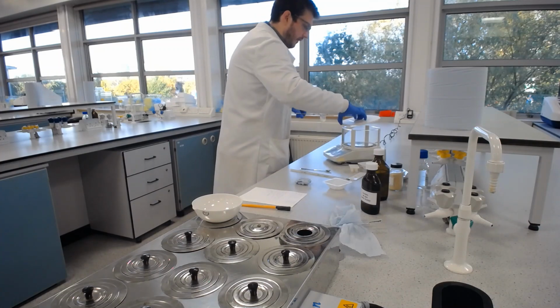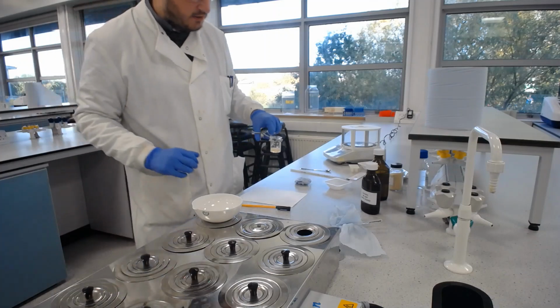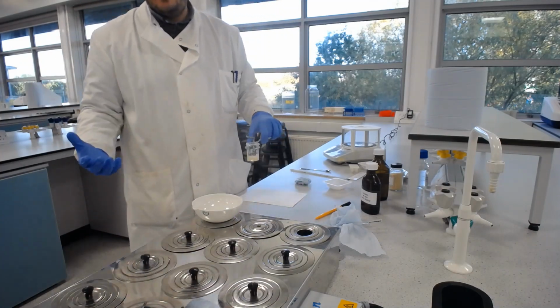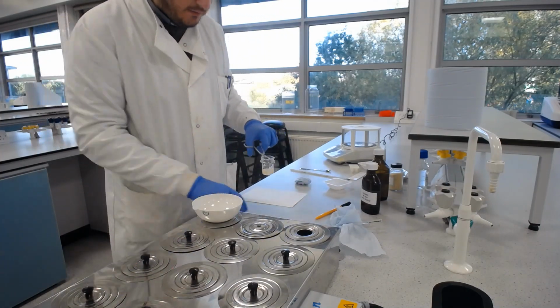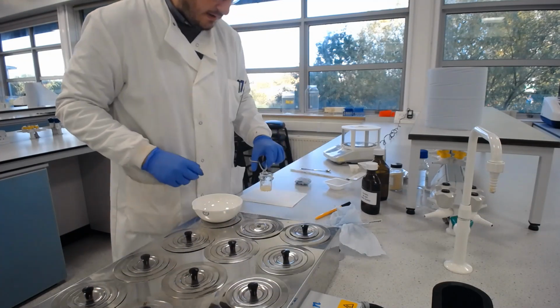So, for the purposes of this demonstration, we're going to say that that's reached the right mass. It's not quite there actually, but just for the purposes of the length of this video, let's say that's reached the right mass. And I'm just going to put those on there.